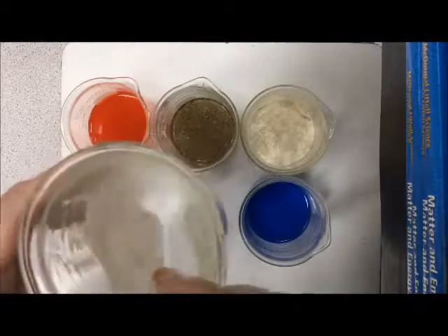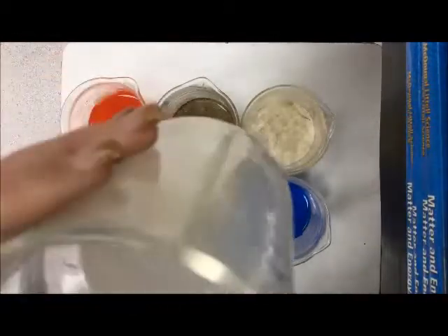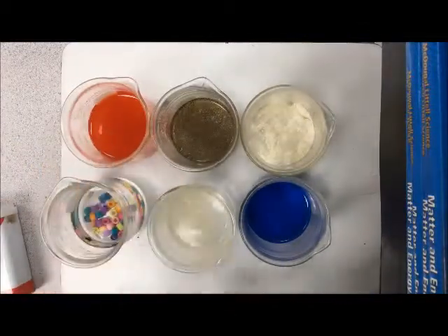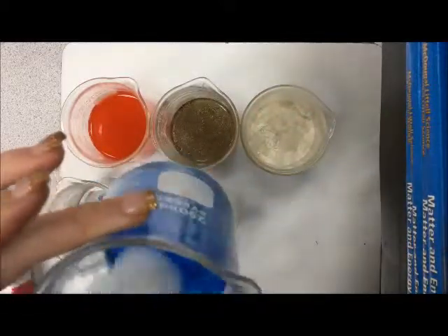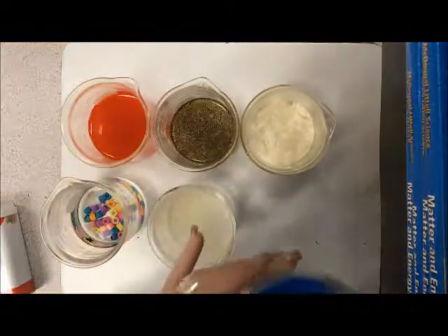Stir, stir, stir. And what do we got there? It's a little cloudy, but we still have rice in the bottom. Now, if I do food coloring here, you can see it's all nice and mixed in.